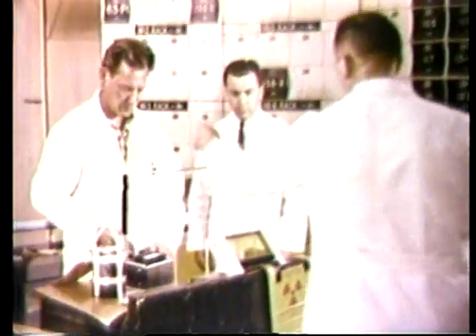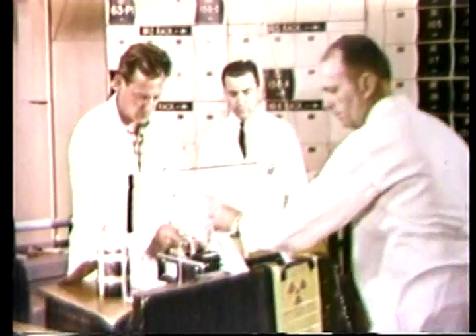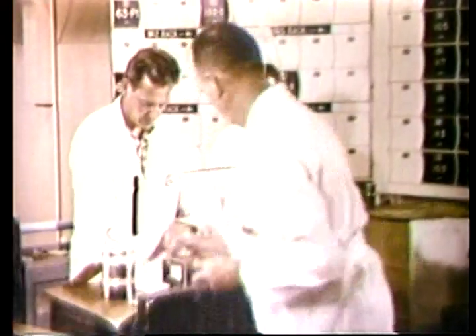A health physicist checks the radiation level to ensure safe handling. The container, with contents, is carried to a work area and placed behind a protective shield. It is emptied of the bone sample and the arsenic standard, each still sealed in its polyethylene tube. Again, the samples are monitored for radioactivity and then placed in a lead container.